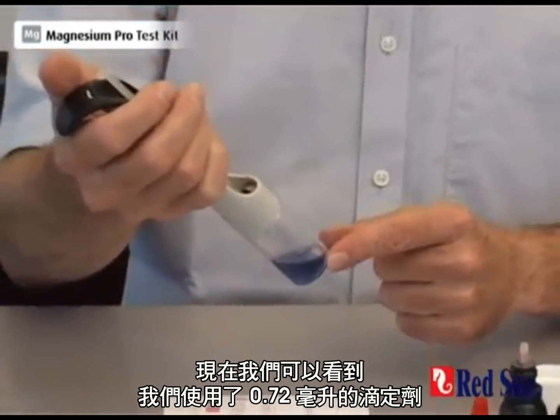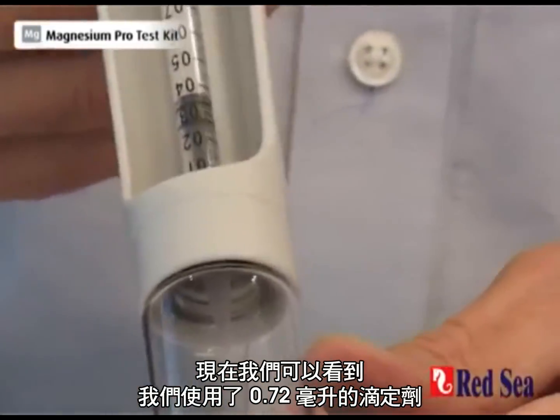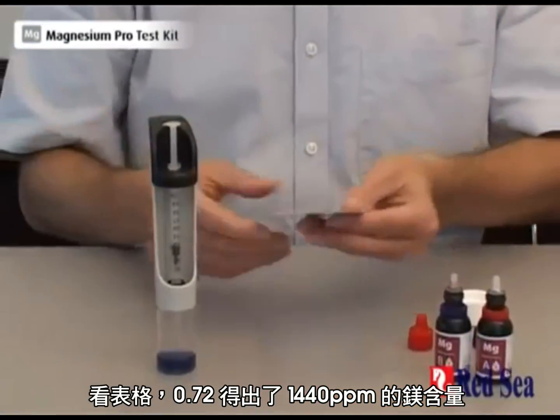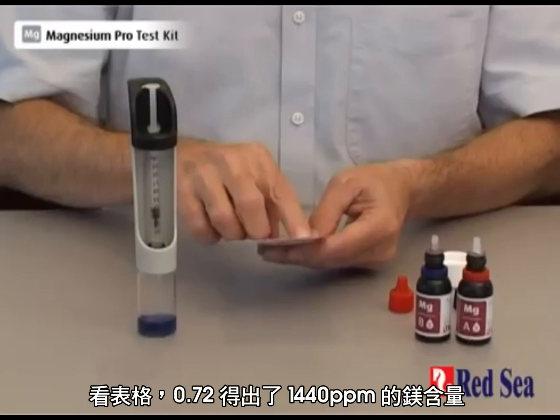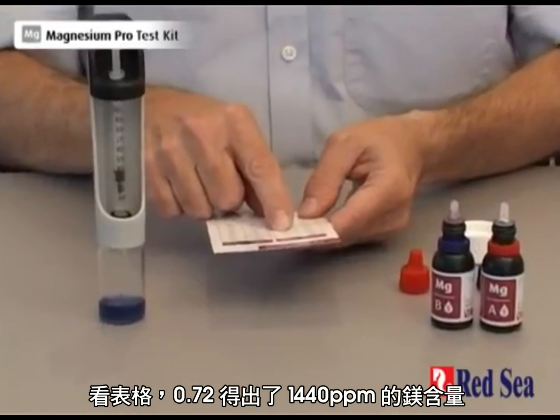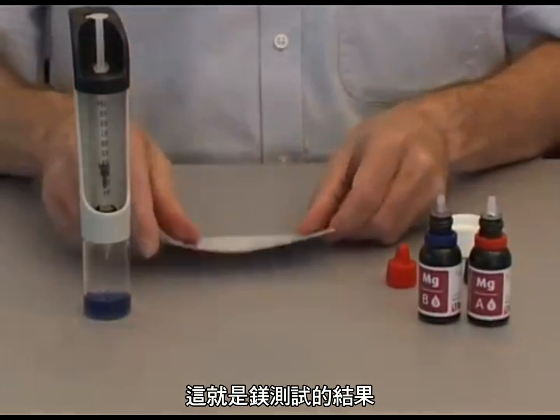Now we look at our syringe and we see that we used up 0.72 of the titrant. We look on our table — 0.72 gives us a magnesium level of 1,440 ppm of magnesium. And that is the end of the magnesium test. Thank you very much.